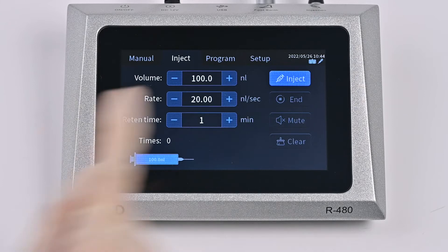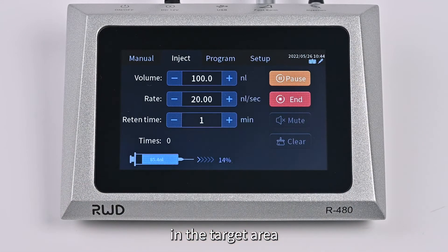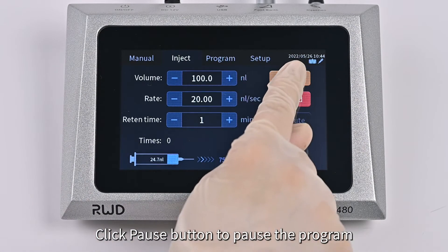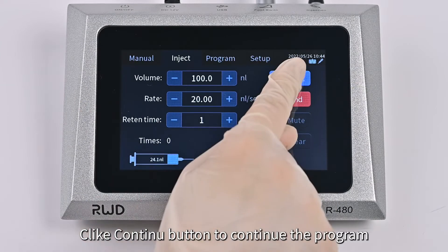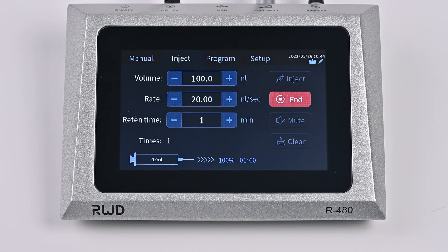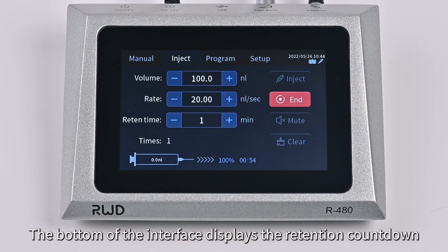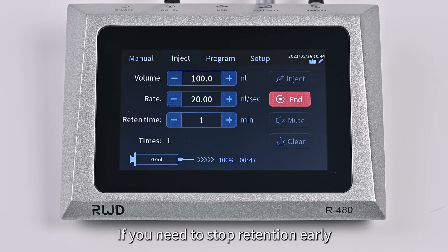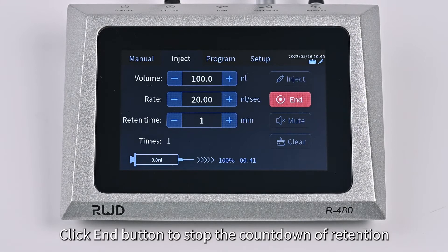The retention time range is from 0 to 30 minutes; the minimum step is 1 minute. Click the Inject button to inject the filling reagent into the target area. The bottom of the interface displays the injection progress in real-time. Click Pause button to pause the program, and Click Continue button to continue. If the retention time is not 0, the bottom of the interface displays the retention countdown. If you need to stop retention early, click the End button to stop the countdown.